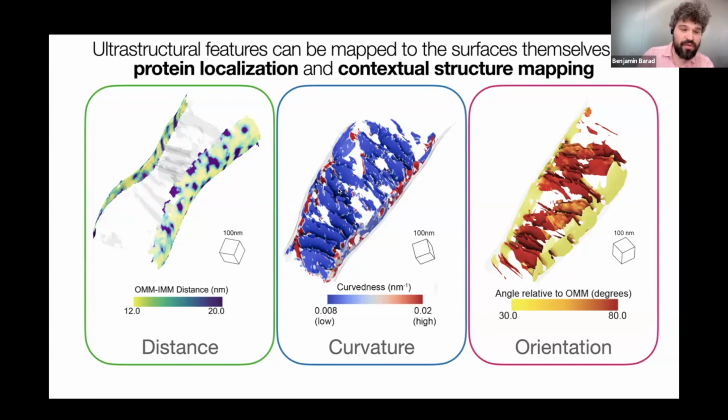And so anywhere that you see membranes bending, you know that there's force being applied to the membrane, either by the accumulation of specific lipids or by proteins that bend the membrane. Because of that, we can make a lot of inferences about where membrane bending force is being generated by creating these local maps of where curvature is in the tomogram.